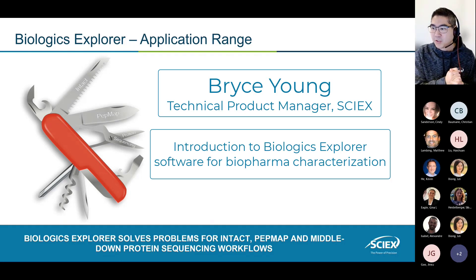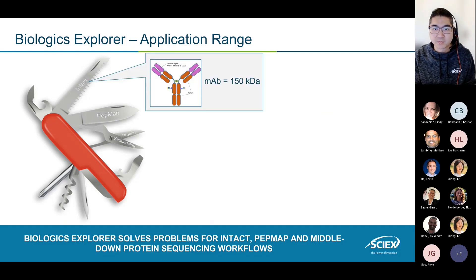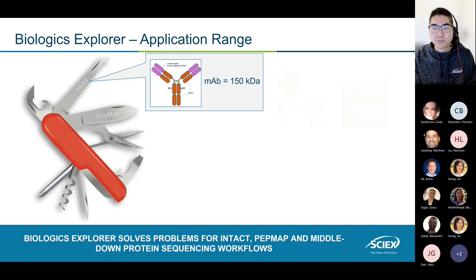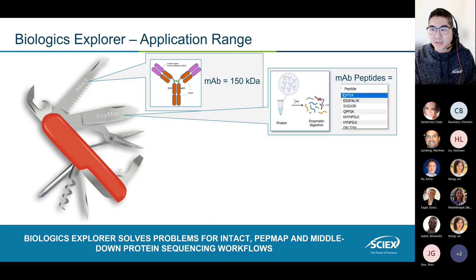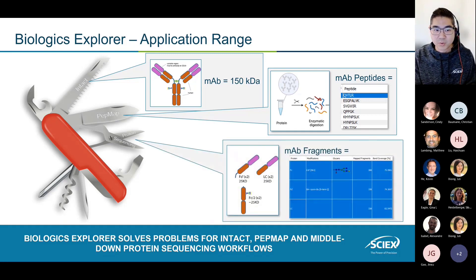Biologic Explorer is our biopharma characterization tool. You've seen it do things like take intact mass measurements and convert them into deconvoluted masses of big monoclonal antibodies. You've also seen it take peptide mapping data and convert it into peptide maps — sequencing peptides, reassembling them according to the predicted sequence, and identifying modifications. What we're going to cover today is protein sequencing: taking proteins that have been fragmented by EAD and converting them into protein sequence maps.